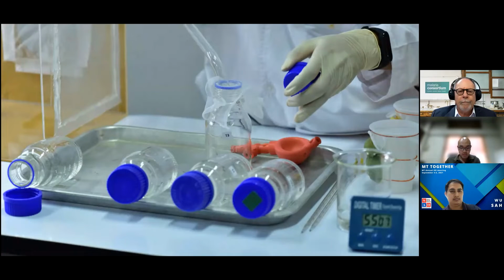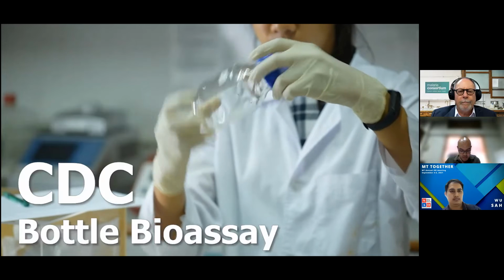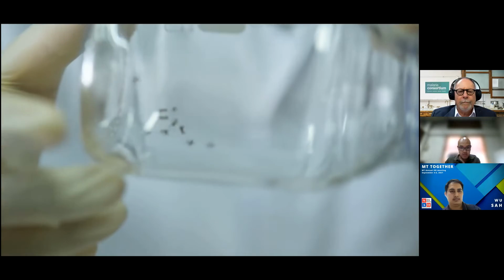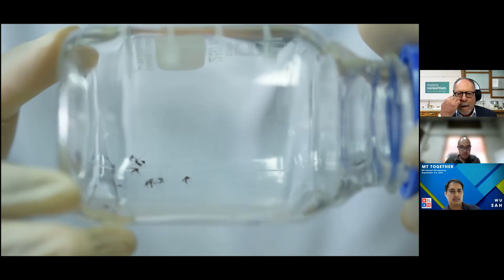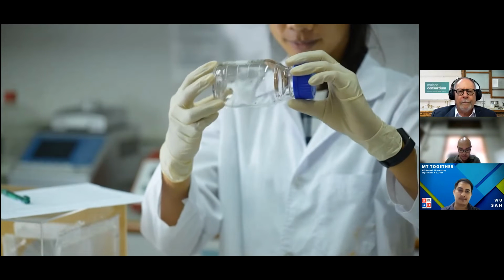Hello everyone. In this video, we demonstrate the CDC bottle bioassay. The CDC bottle bioassay was developed by the United States Centers for Disease Control and Prevention, shortened to CDC. It is also a widely used and internationally accepted surveillance tool for detecting resistance to insecticides in vector populations.